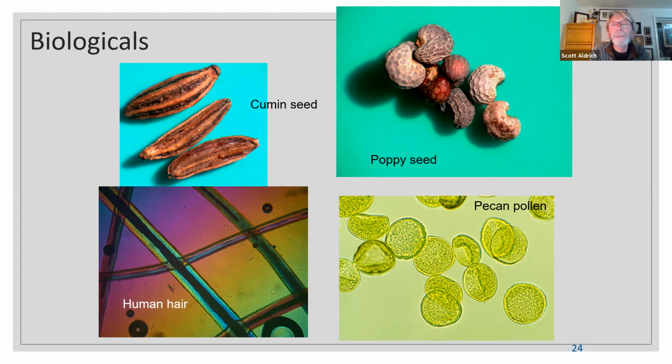And you can play around with these things too and make them look pretty cool. As Shirley alluded to, sometimes she loved me, sometimes she hated me. Usually what I would get at project team meetings when I would show folks the results of an analysis, they'd say, oh, well, that's all well and good, Scott, but man, those are pretty cool pictures. How'd you do that? And that early on got me thinking about generating photomicrographs of fusion preps.